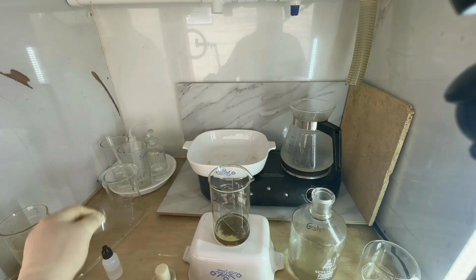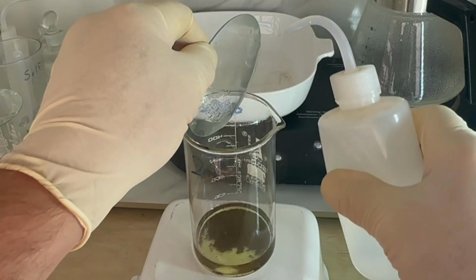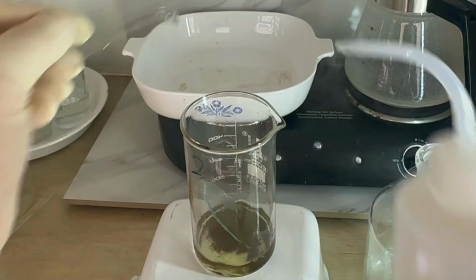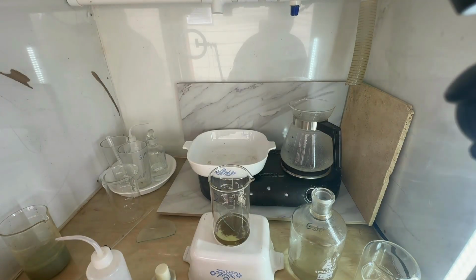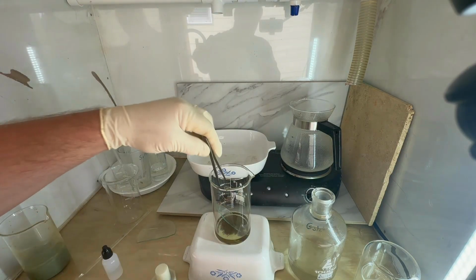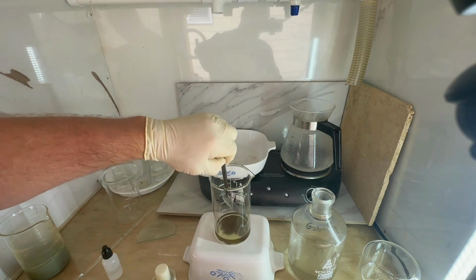So we'll rinse this off. Whoa, that was fun. Thermal shock in slow-mo right here. Looks like I might have to buy some new watch glasses. We're going to get that piece of glass out of there. Continue with our washes, making sure to rinse off any gold that might have stuck to it.